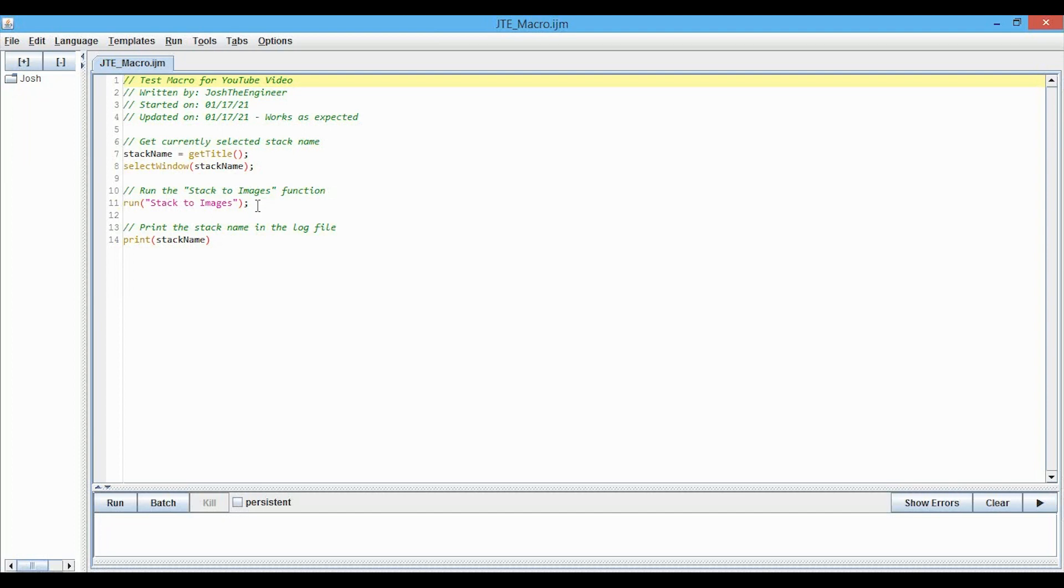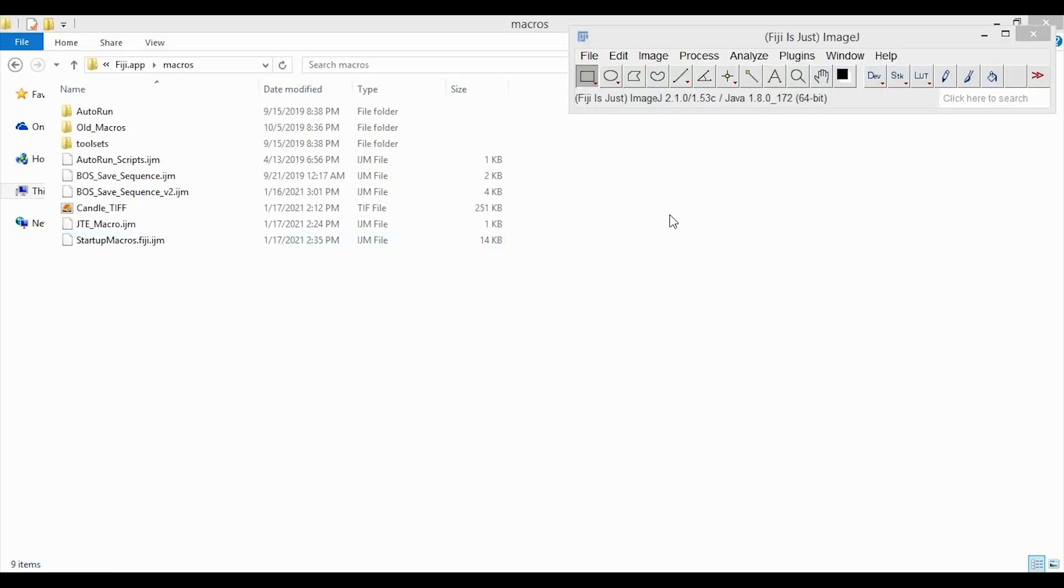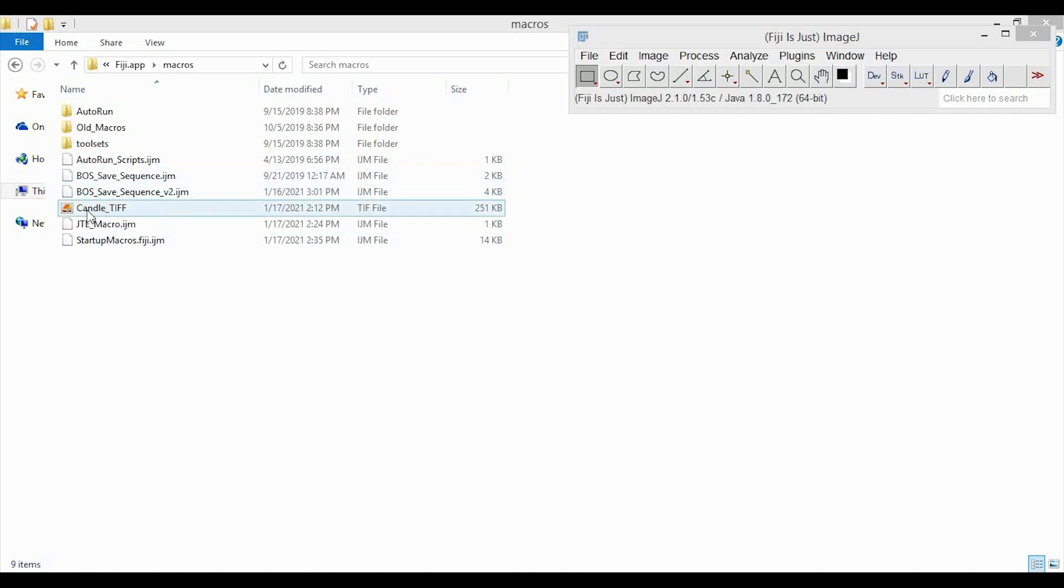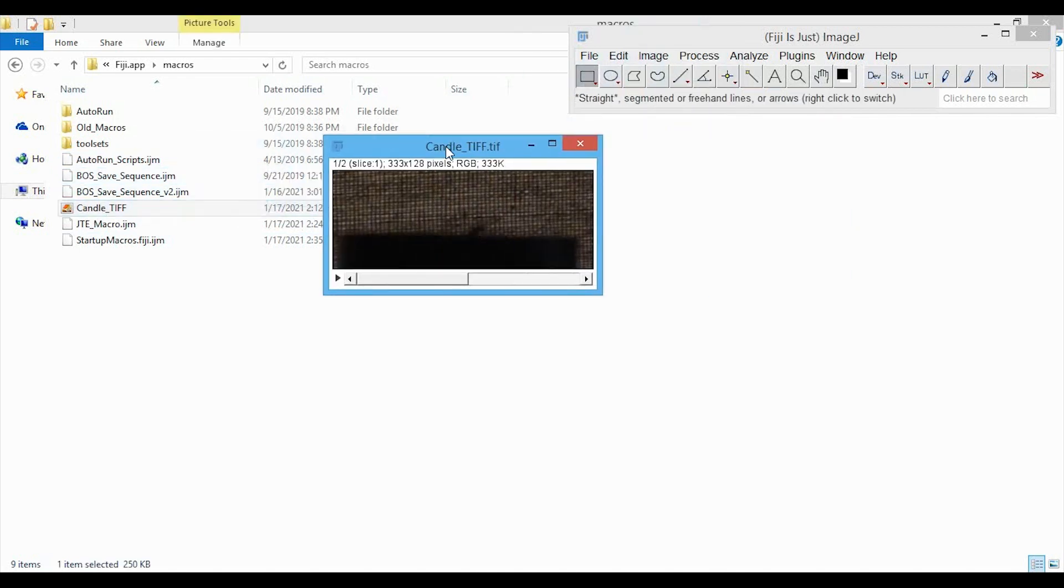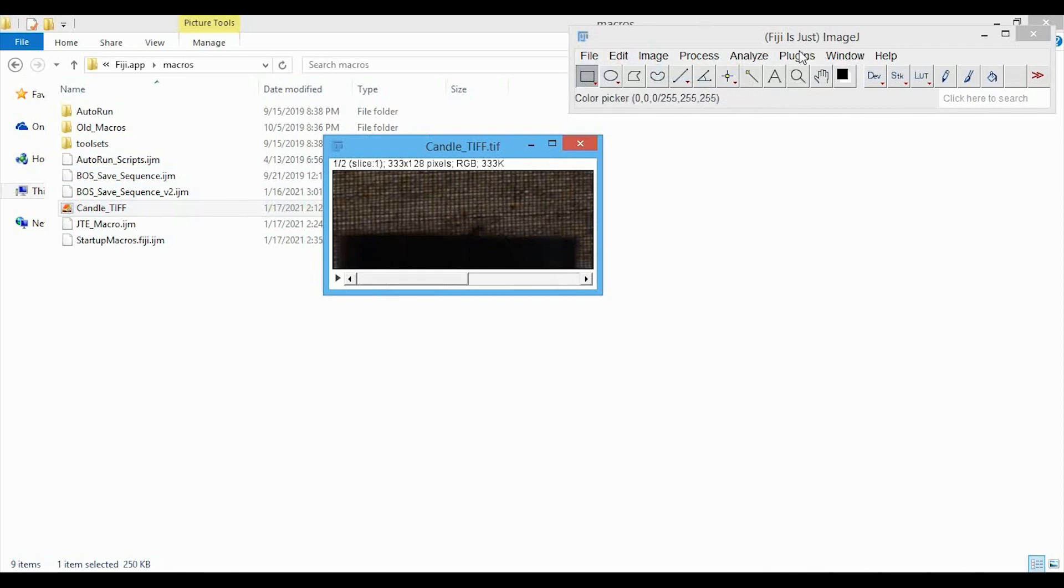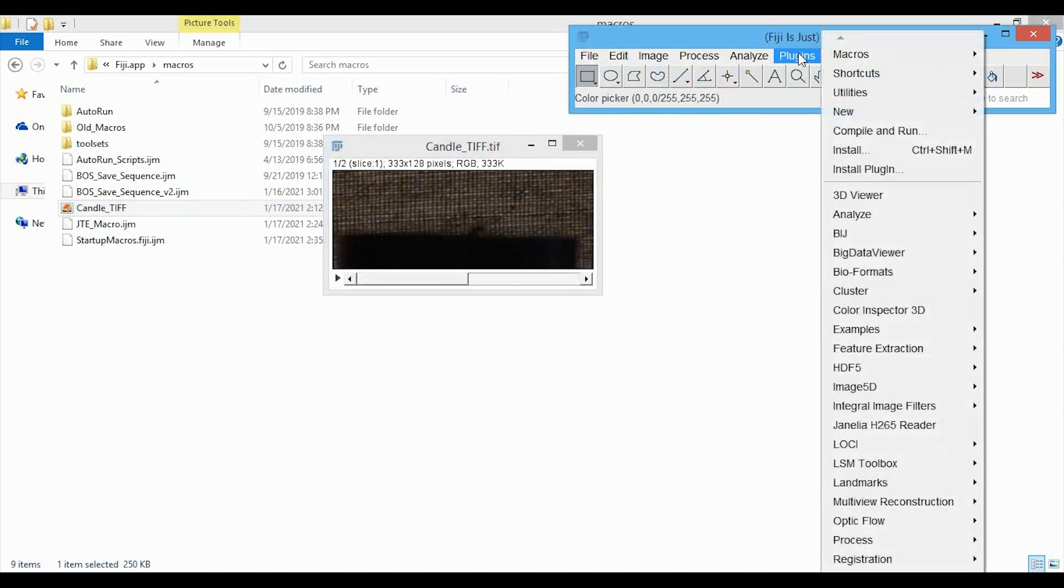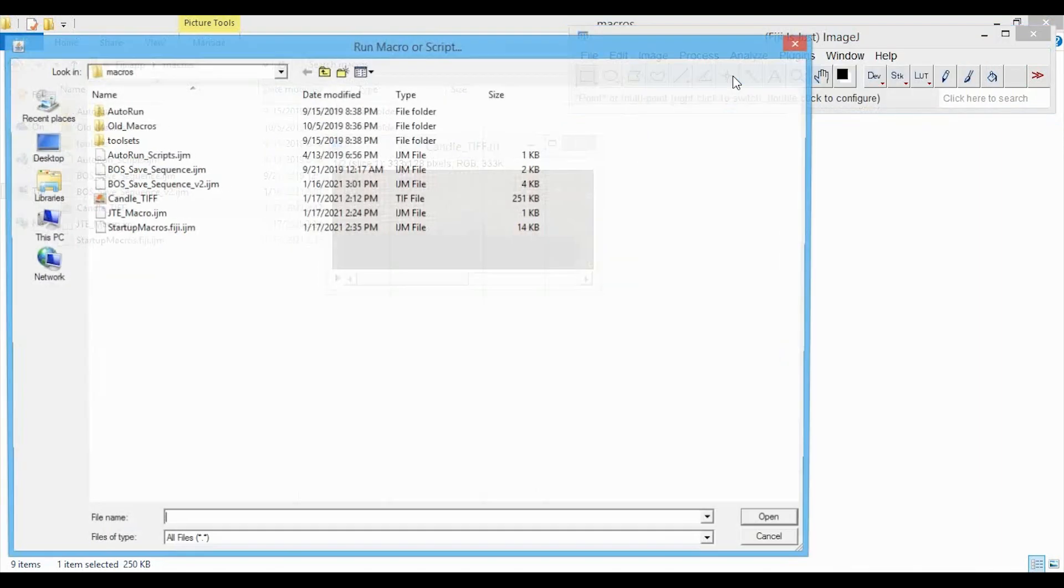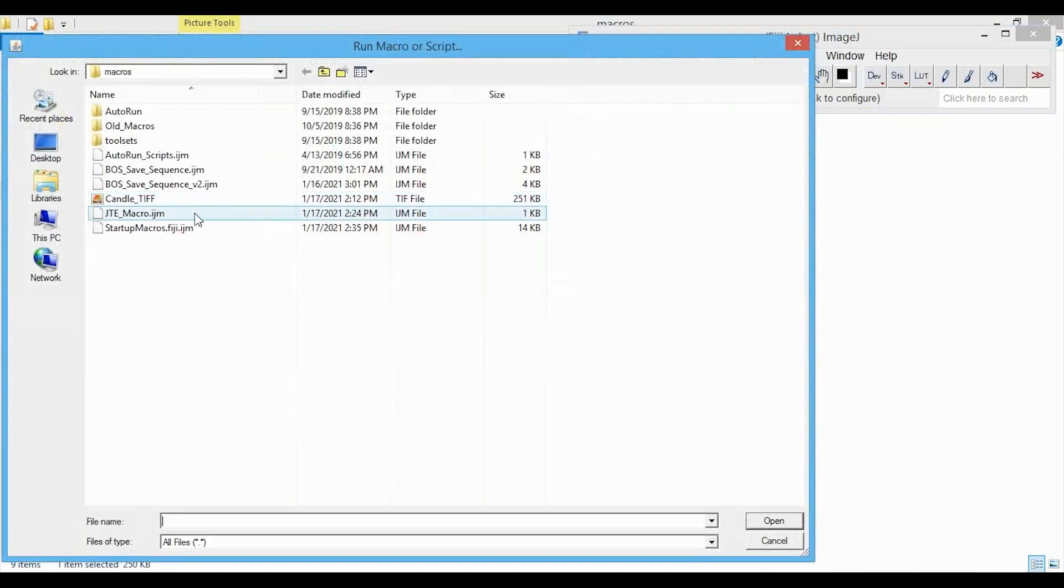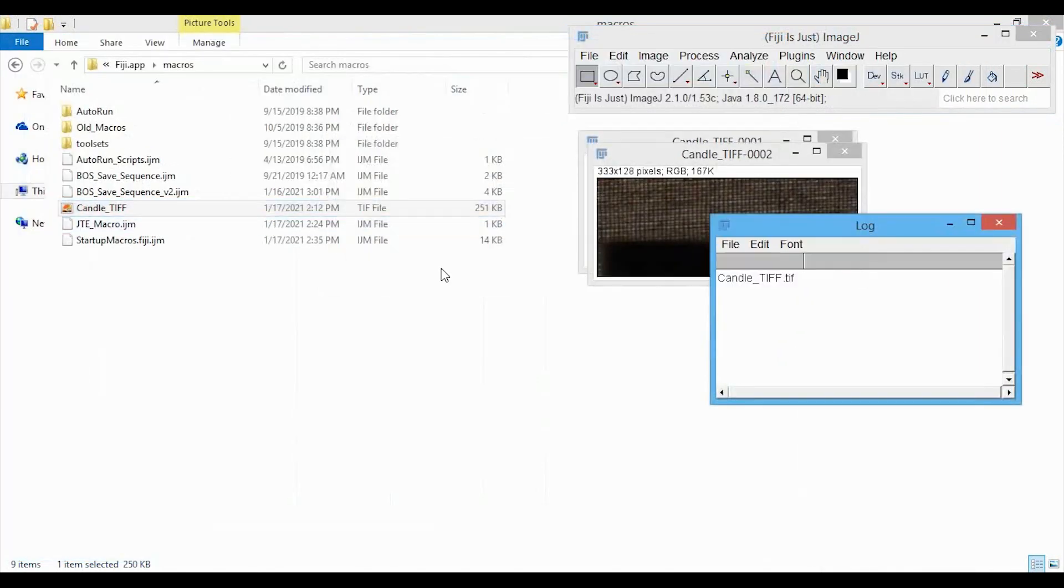To run this macro in the normal way, let's first open up a stack, which is called CandleTiff, and I'm opening that up here. This has two slices, one, two, and we can run the macro in the normal way by going to Plugins, Macros, Run, and then we just double click on that file. You can see it splits it out into two images and prints the stack name to the log.